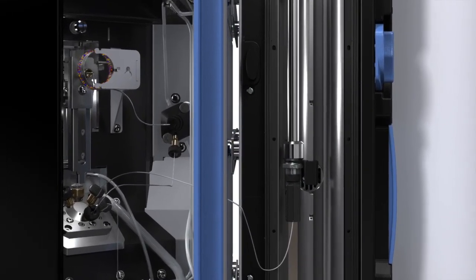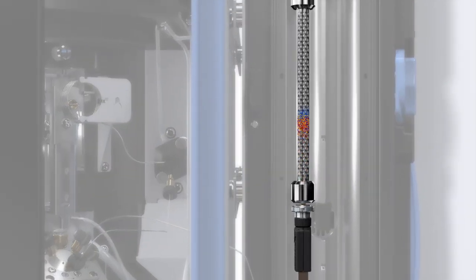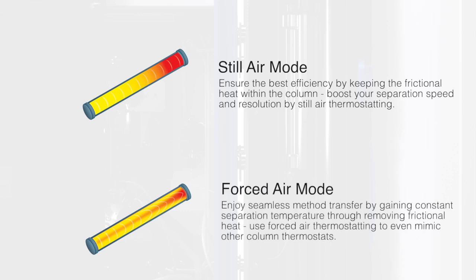Temperature rules retention, selectivity, and efficiency of your chromatography. Therefore, the column compartment was designed to enable you to control your separations with more confidence. There are two available heating modes: the still air mode to maximize efficiency and boost speed and resolution, and the forced air mode, which allows for seamless method transfer.